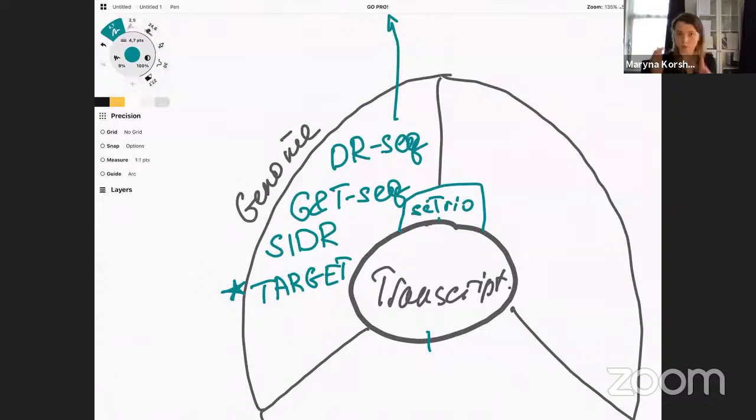After that, you already split your DNA and RNA content. You do independent analysis of DNA, such as library preparation, and RNA processing using single-cell RNA-seq. Methylation is, in this case, also used, and this methylation is measured by a single cell RRBS tool, which we will discuss just a little bit later.